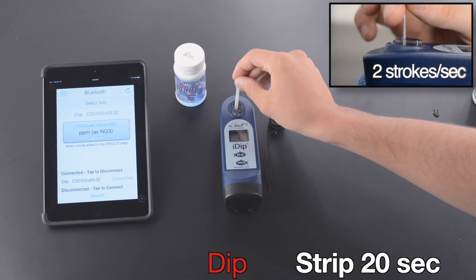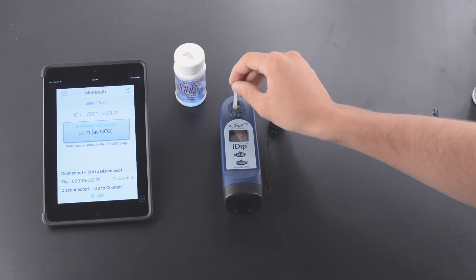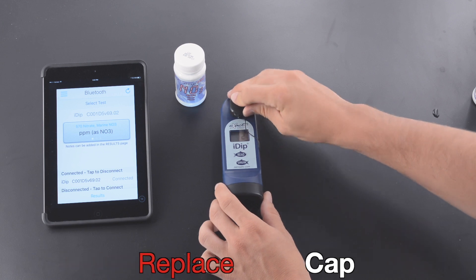Dip Strip for 20 seconds. Two strokes per second. Remove Strip at one second. Replace Cap.